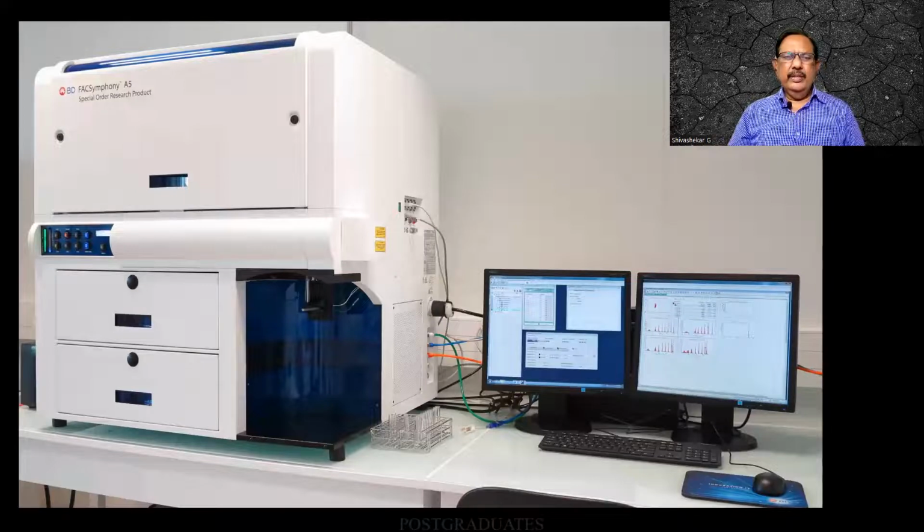And of course, this is a modern flow cytometer. Maybe you people would have seen better versions of these. There's a probe which is making a suction of it. There is a single column that is taken. The cells are being made to flow in a single column subject to the laser light, and there will be a series of detectors. That can be the light scatters. Finally, there is an image over there which is captured onto the computer, which can be in the form of a graph or it can be a dot plot.